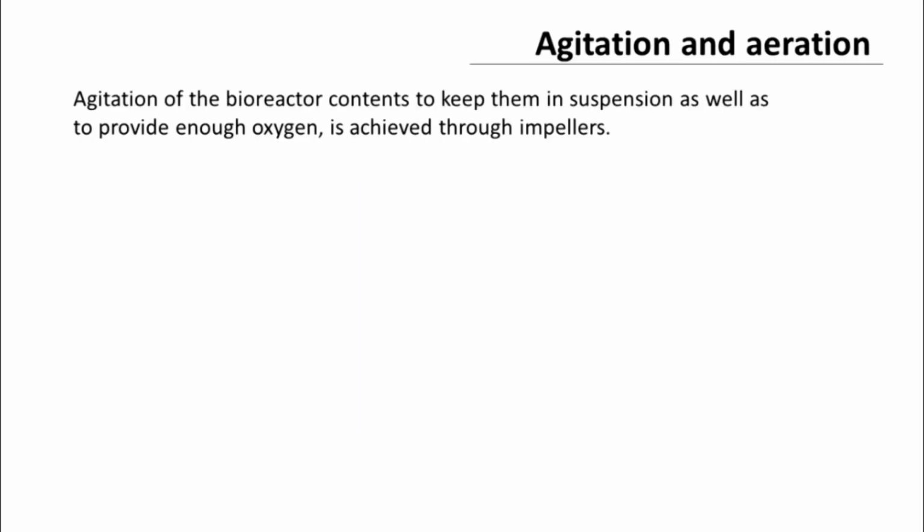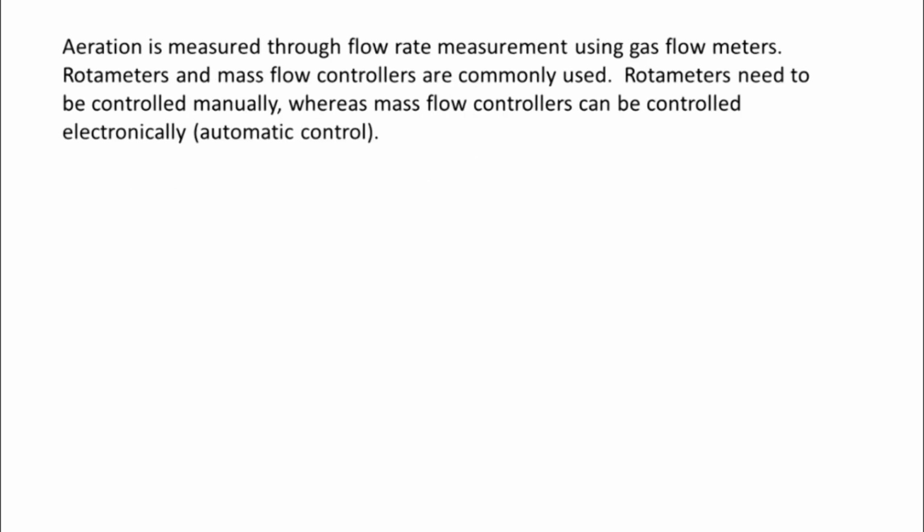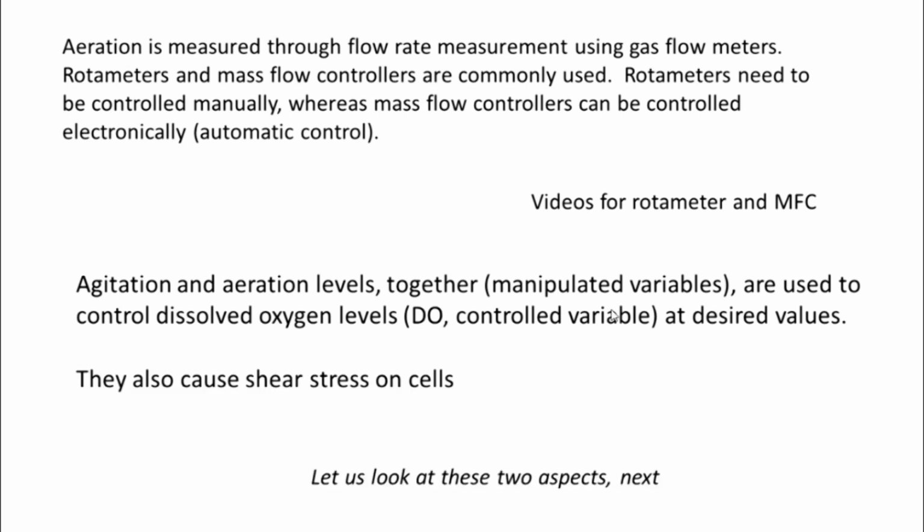Then we looked very briefly at aeration and agitation. Then we said how they could be controlled. We said they keep the cells in suspension, but they also cause shear stress on cells. We said we will look at these two aspects starting in this lecture. Let's go forward.